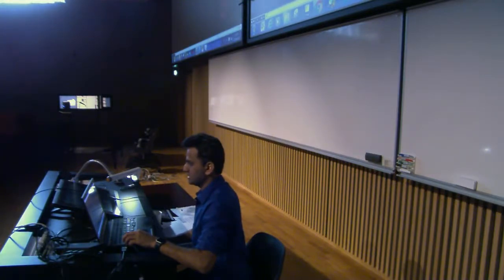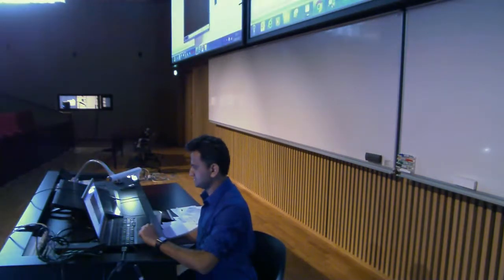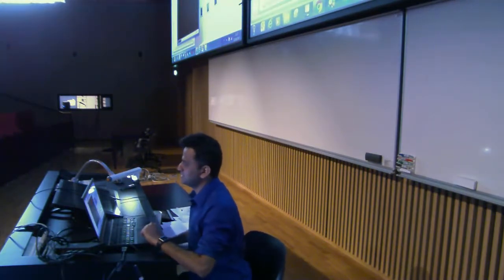This one, and then go back again. Say view and stop freehand recording. So you can make actually the movie out of this. You can also record from here. But I would advise you to go to Imaris to have the animation.